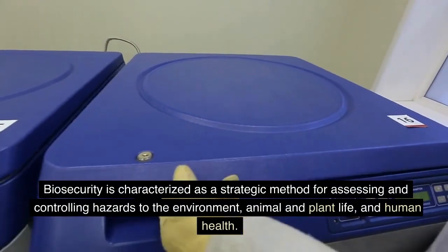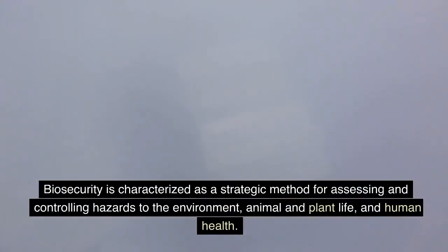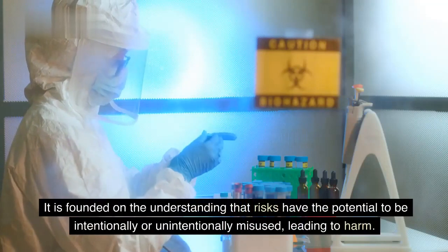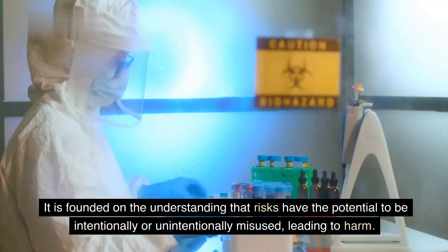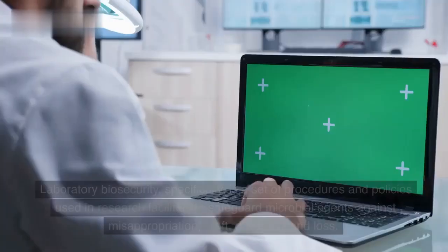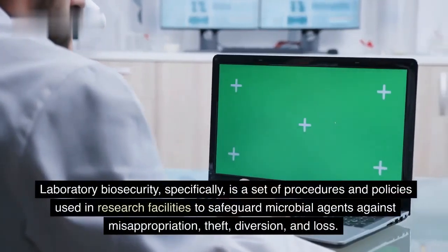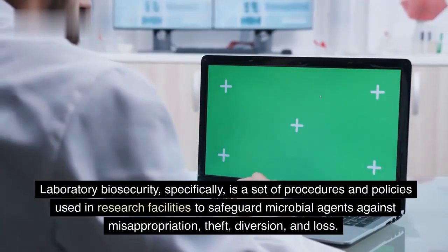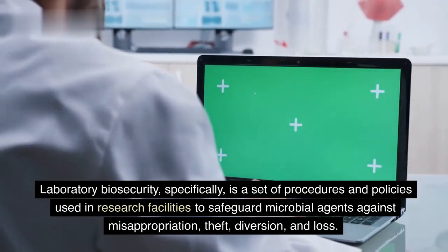Biosecurity is characterized as a strategic method for assessing and controlling hazards to the environment, animal and plant life, and human health. It is founded on the understanding that risks have the potential to be intentionally or unintentionally misused, leading to harm. Laboratory biosecurity, specifically, is a set of procedures and policies used in research facilities to safeguard microbial agents against misappropriation, theft, diversion, and loss.